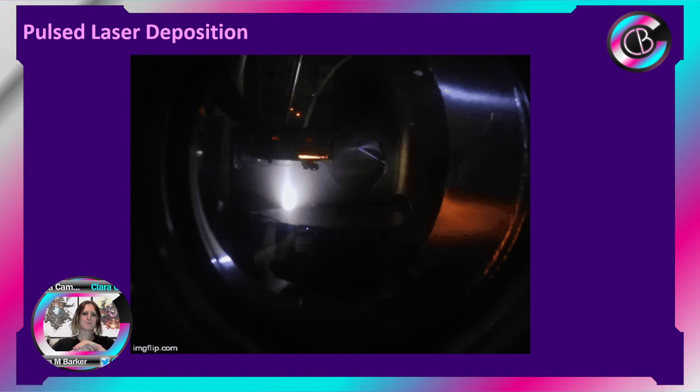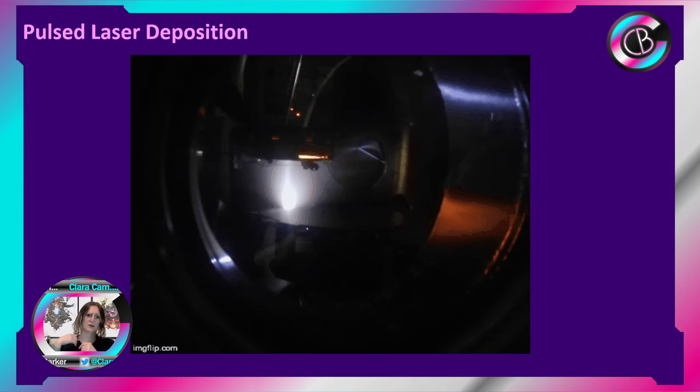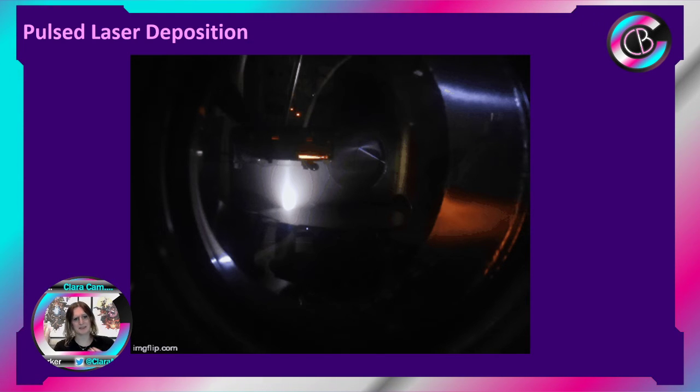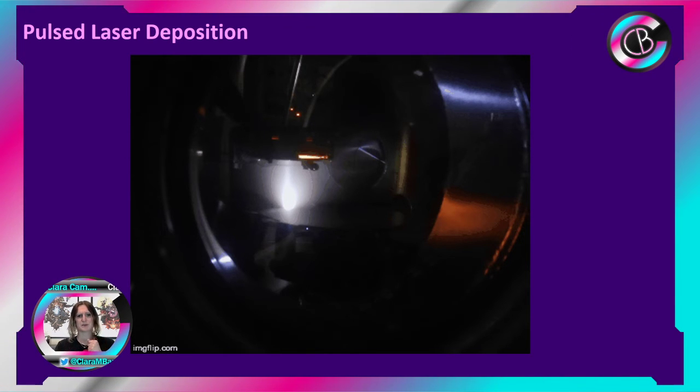So pulsed laser deposition gives us more parameters than, say, evaporation, where you provide the temperature. That doesn't mean evaporation is a simple process, and there are plenty of things you can tune, but with pulsed laser deposition we've got different properties we can tune.